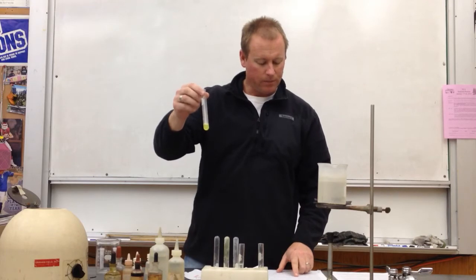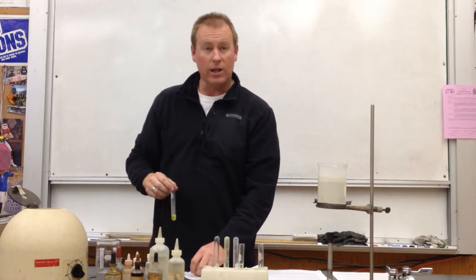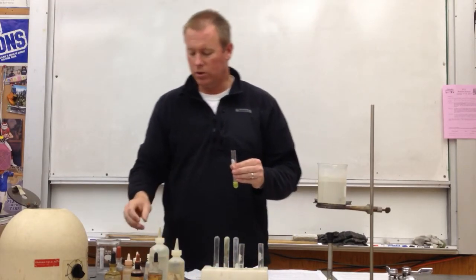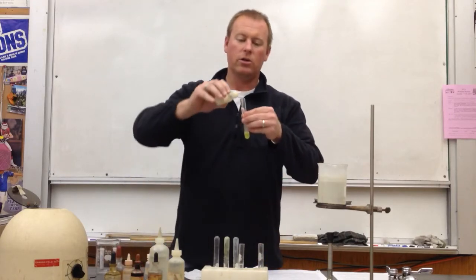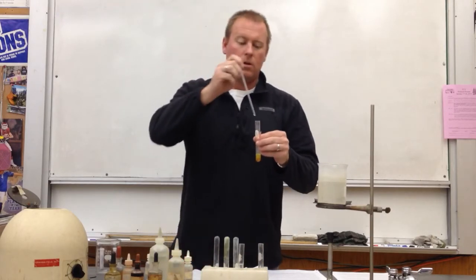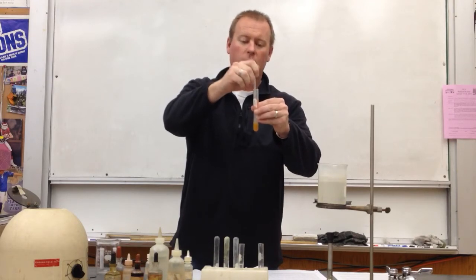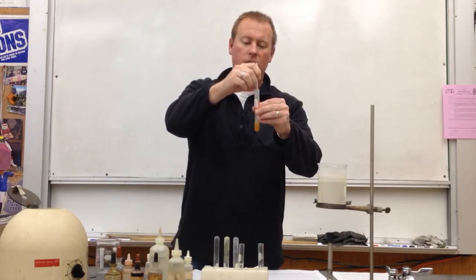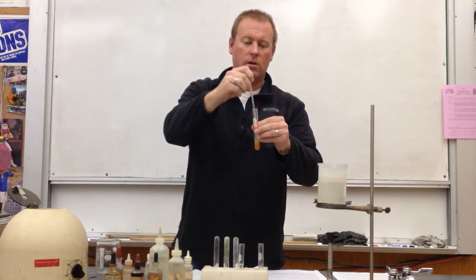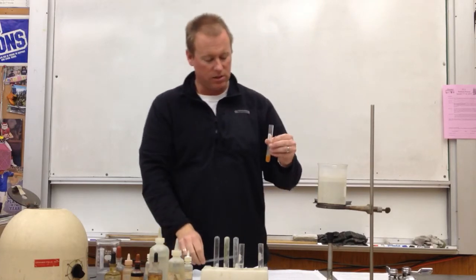So let's continue reading. Using NaOH, make the solution basic. So again, we're going to be using some red litmus paper. To make it basic this time, instead of the ammonia water, we're using sodium hydroxide, NaOH. And we'll stir that up. Whether you have a small amount of solution or a large amount of solution, you want to make sure that you stir thoroughly from top to bottom so that the solution is uniform all the way throughout. And as I swipe it across there, that red litmus paper has turned blue, so I know that it's basic.